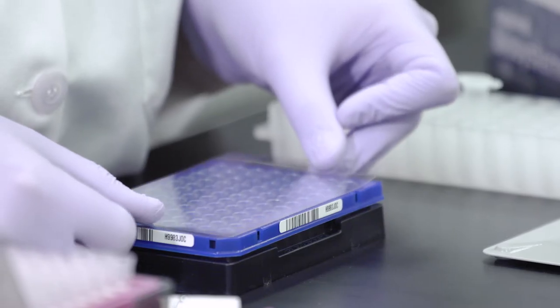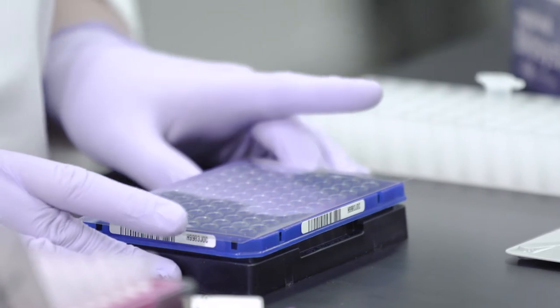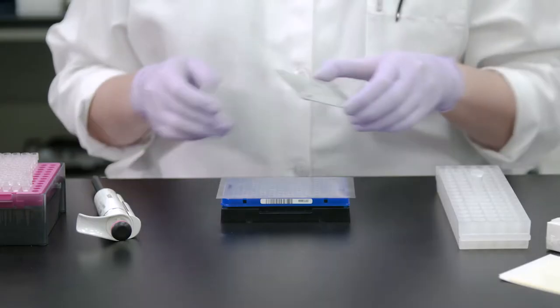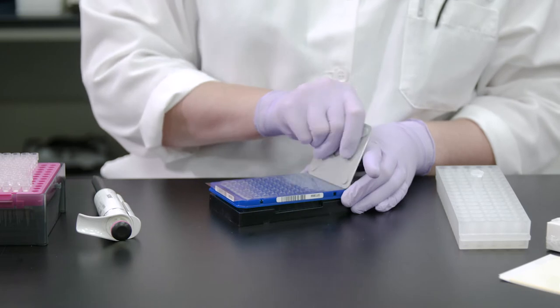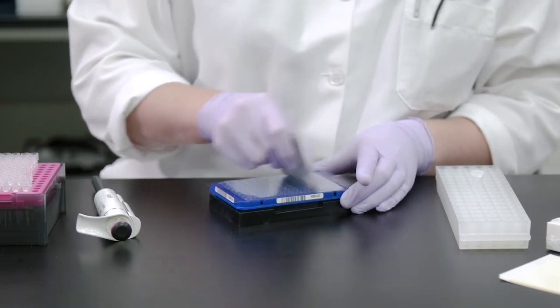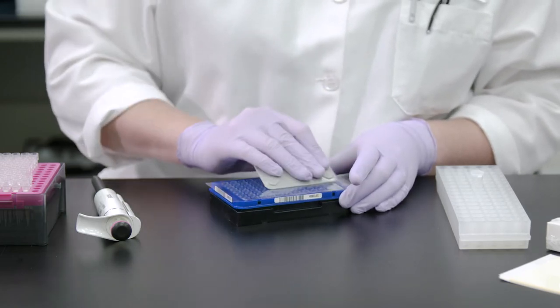Next, align the adhesive film to the plate so that all of the wells are covered. Using the adhesive film applicator, press and move the flat edge of the applicator back and forth along the long and short edge of the plate.